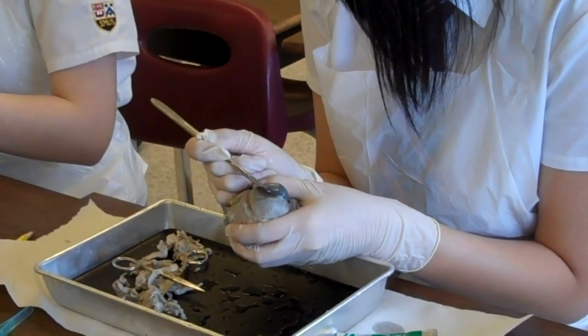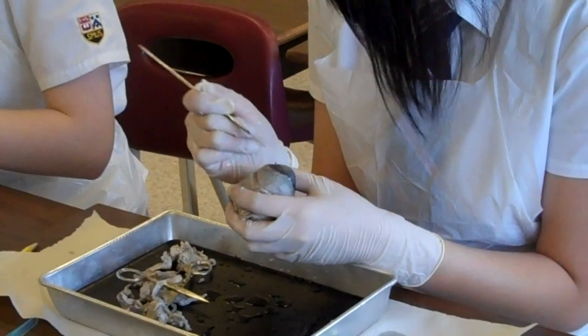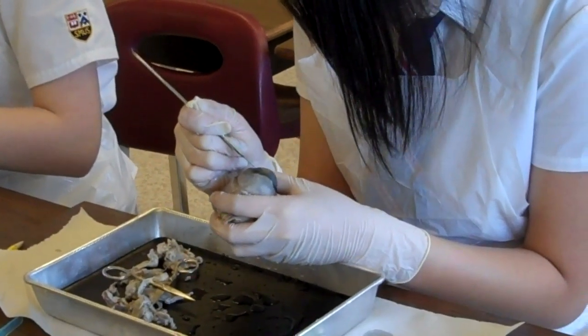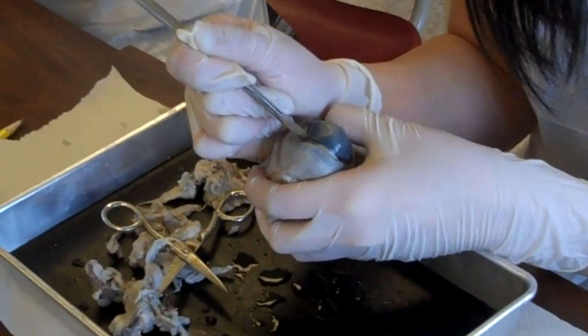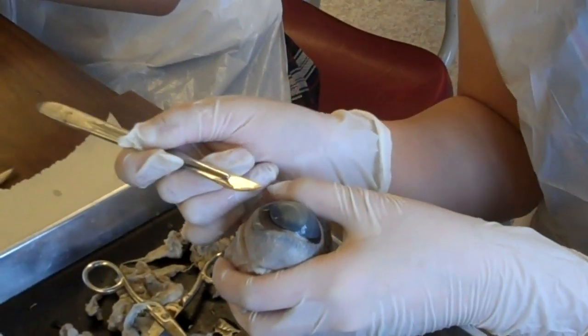Please don't spray me. My arms are wet. How are you supposed to get... Ew, it's coming out. Are you supposed to get the cornea all the way?